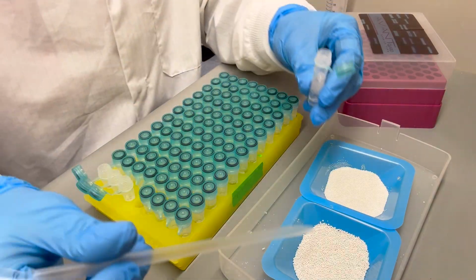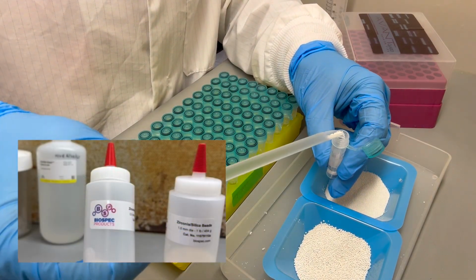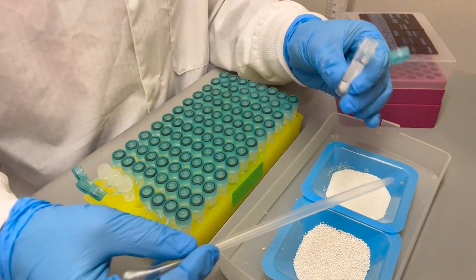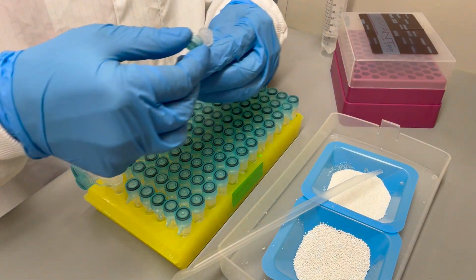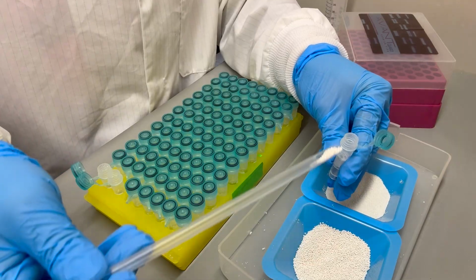I also add 2 different sizes of these zirconia beads to the tubes. Now these beads are actually used later in the DNA extraction, but adding them now is much easier while the tubes are still sterile, and it minimizes the number of times that we have to open the tubes later, therefore minimizing the chance that we accidentally cross-contaminate one sample with another.